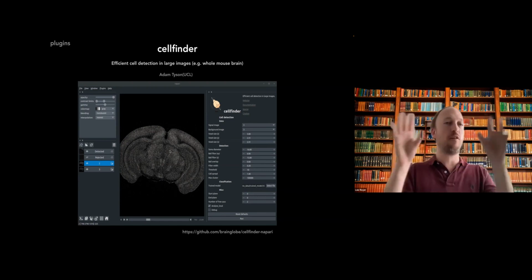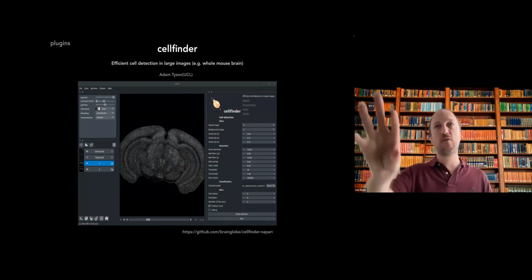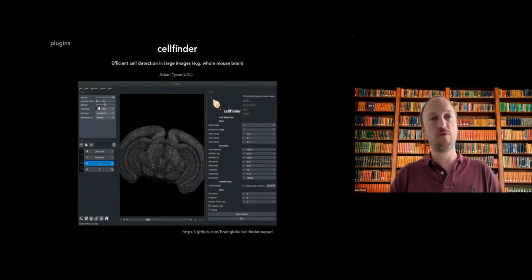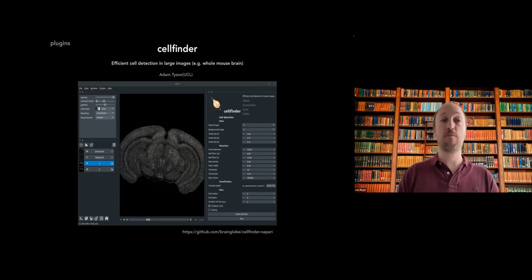And so basically, almost by magic, these very complex UI elements with lots of parameters get generated automatically for you, and so you don't even have to know how to do UI programming. So really a fantastic feature, because of course we want to facilitate the work of people to port some of their Python code, algorithms and workflows into Napari plugins, and so that was a very great move by Tali to make this possible.